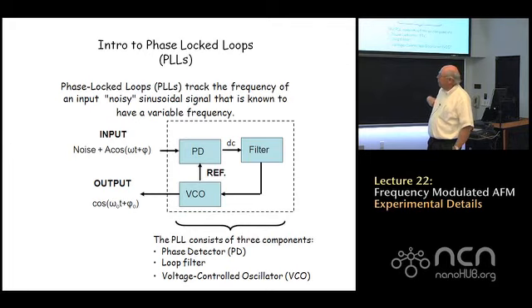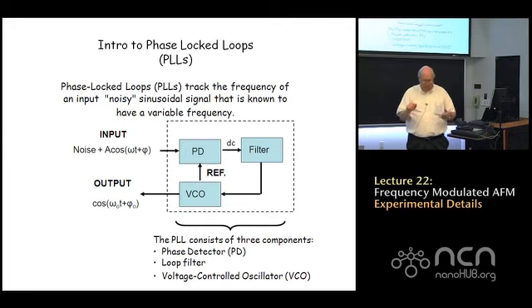mode of operation. And basically what happens is you put your input frequency in, you turn the feedback loop on, you activate it, and within a second or two, you hope you get a lock condition in which the omega naught and phi naught are now locked to omega and phi. And if omega and phi vary with time for whatever reason, right, this feedback loop is instructed to change omega naught and phi naught in order to keep this lock, right? So the omega naught and phi naught, that's something that you can measure, right? That's a clean signal. You can measure that with a variety of different techniques.